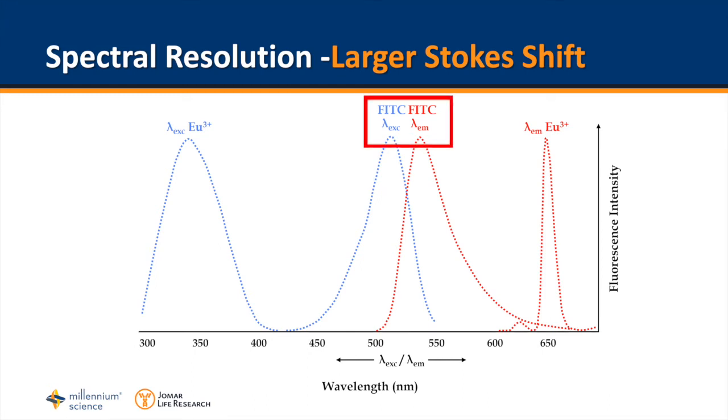If you have a narrow Stokes shift, like with fluorescein, and don't set your bandwidth appropriately, you will get something called internal quenching, resulting in reduced count, sensitivity, and signal to noise, as well as reduced Z primes in your assay. And as a result, it is somewhat compromised. Lanthanides, on the other hand, have a near UV spectra with around a 330 to 340 excitation and a red shift emission around 615. There is a huge difference in Stokes shift with 0 overlap.